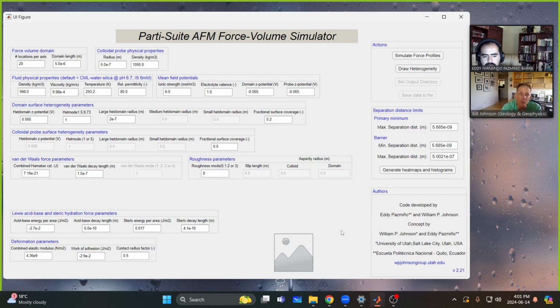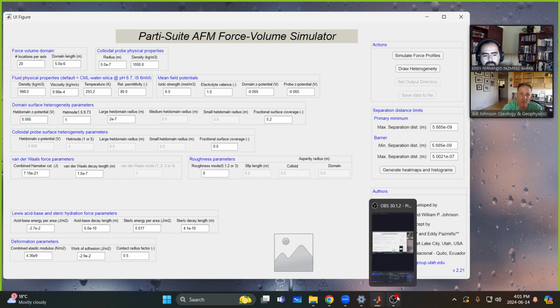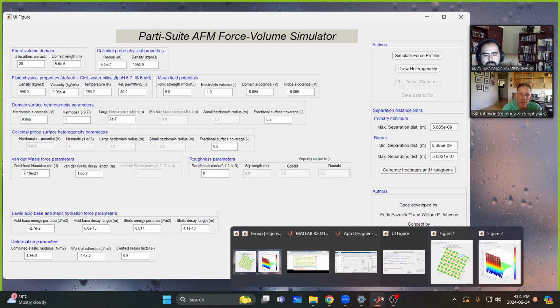Once you create multiple points of contact, now you strengthen the adhesion. And so colloids do become less reversibly attached. They're harder to knock off once they're attached to a rough surface. But the roughness didn't flip the interaction from repulsive to attractive. What it did is strengthen the adhesion on whatever interaction occurred there.